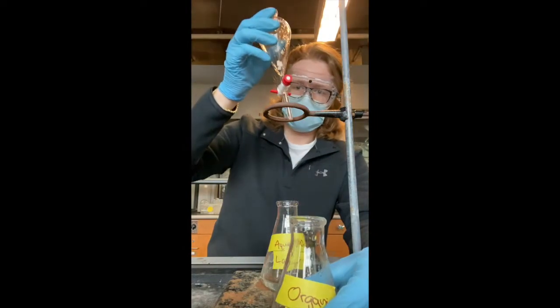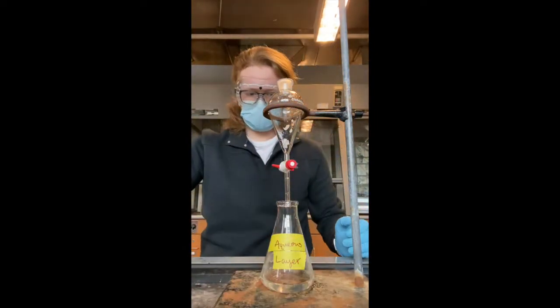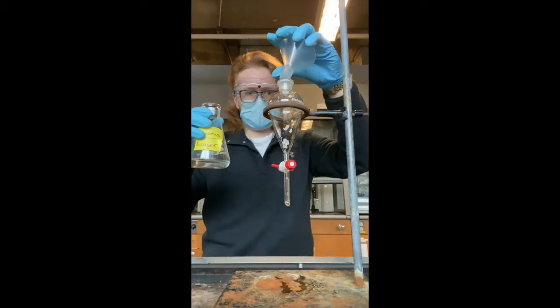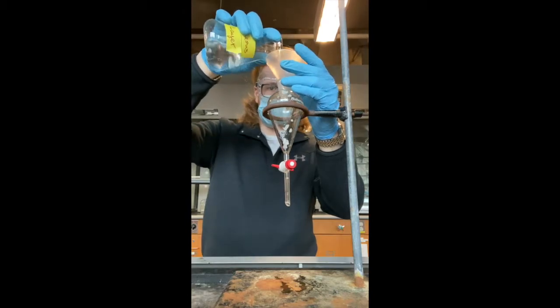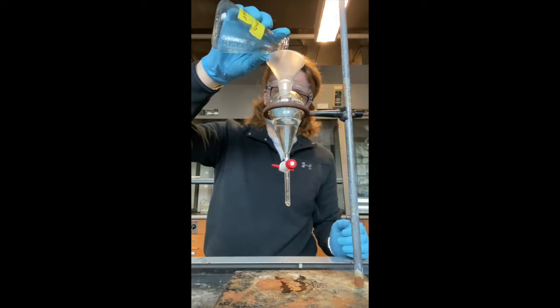Once finished, you will want to place the separatory funnel back into the ring clamp on the ring stand. After ensuring that the stopcock is closed, you will want to place the funnel into the top opening of the separatory funnel and pour the aqueous layer back into the separatory funnel to continue with the extraction process.